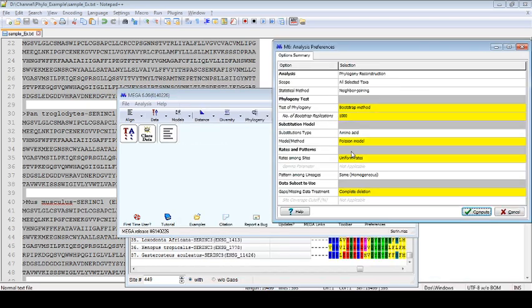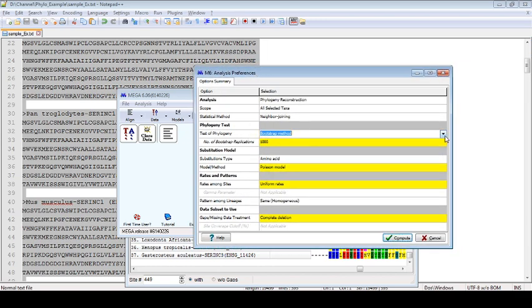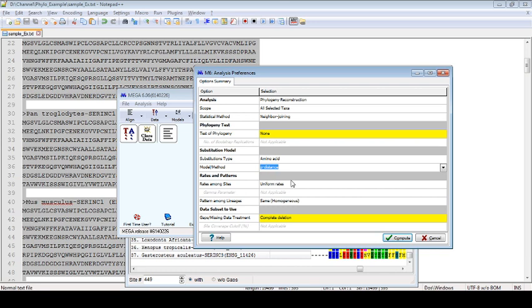Now it's run by MEGA, and I have selected the neighbor joining method. We haven't talked about bootstrap right now, so we just excluded bootstrapping and chose the neighbor joining method. And then there is the substitution of amino acid method. There are different types of models, as we have discussed, to calculate the distance. You know about p-distance, that's Hamming distance, and there are other methods. We have discussed a couple of basic concepts, so we just select the p-distance.